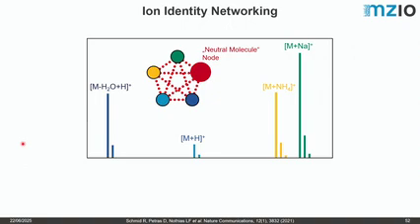And then since we don't have just spectral similarities, but we also may have, for example, ion identity profiles, and we have different ions and in-source fragments, we can basically also build some additional layers on top of the molecular networks, which will give us an additional connection.